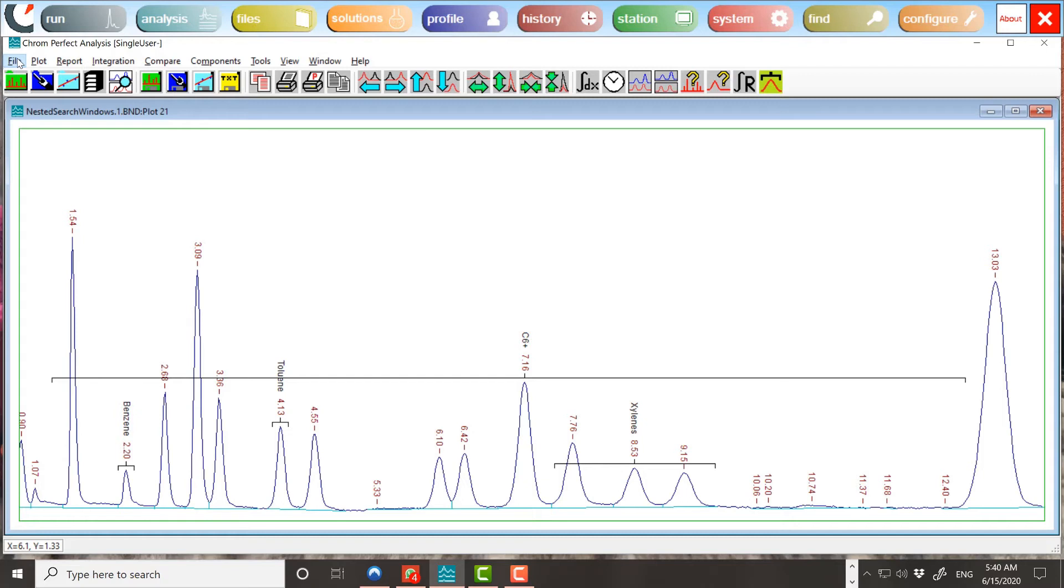When assigning peaks to search windows, the components are arranged in order of their search window widths, narrowest first. Each component gets to mark the peaks that lie within its search window. A component with a multi-peak window marks all of the peaks that lie within its search window. A component with a normal single-peak window marks only its identified peak. Any other peaks within the search window are left marked as they are.